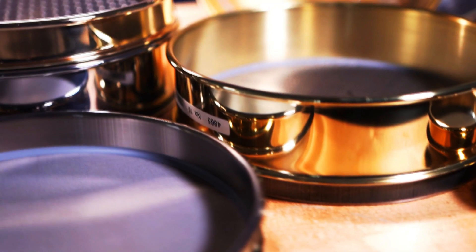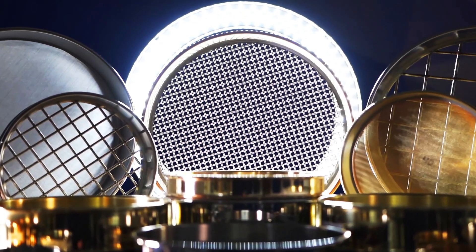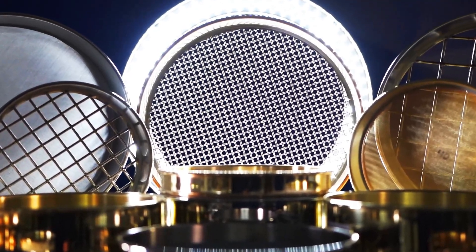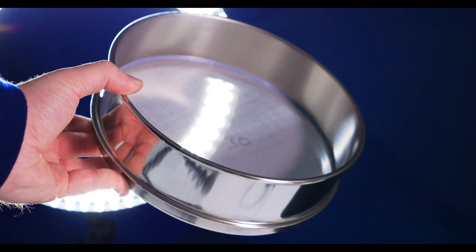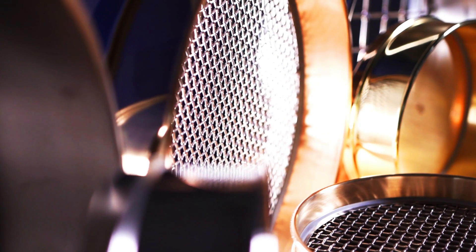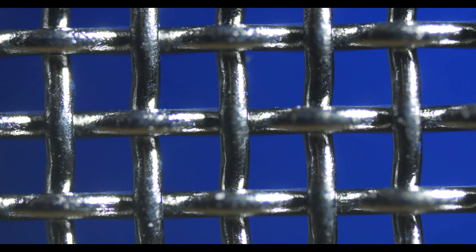WS Tyler manufactures testives in three standard configurations for 8-inch and 12-inch diameters: brass frame with brass mesh, brass frame with stainless steel mesh, and all stainless steel construction. All other diameters are offered in the all stainless steel or brass frame with stainless mesh configuration. Brass mesh is much softer than stainless steel and it used to be significantly less expensive. However, in today's market, stainless steel is much more widely used. It's three times as strong as brass and it can be used to test abrasive materials in harsh conditions.